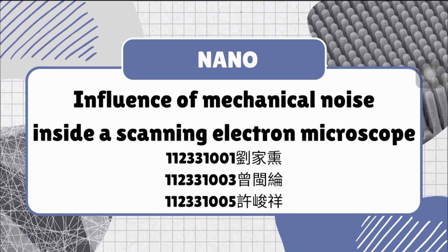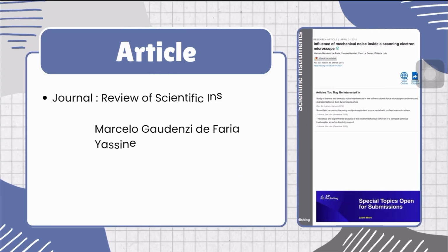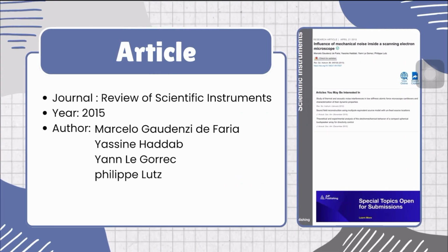Hello, today we are talking about the influence of mechanical noise inside a scanning electron microscope. Our group members are Liu Jiaxun, Zhen Minlun, and Xu Junxiang. This page is the source of this article.